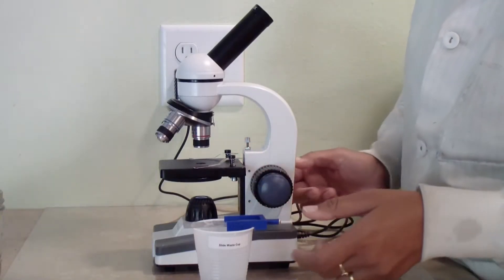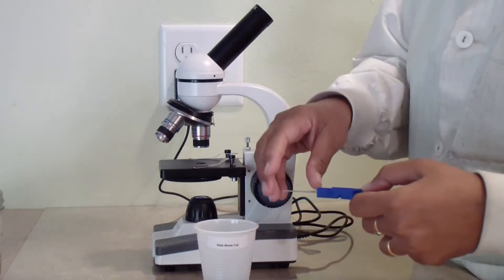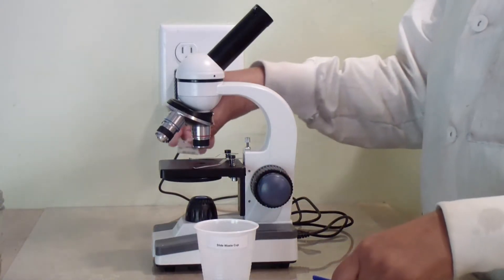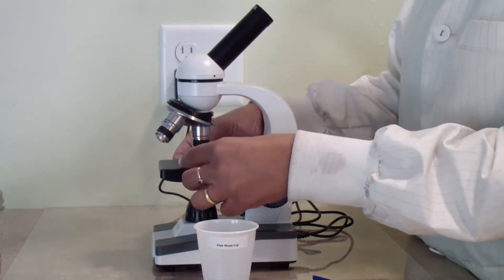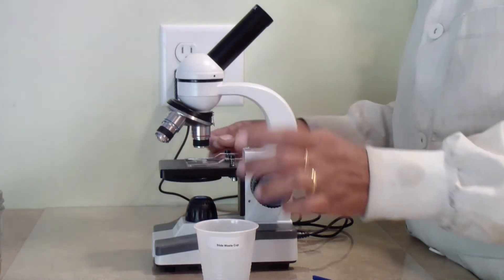Put the slide on the microscope stage. You will observe the sample at two magnifications: low magnification to scan the slide and medium magnification to see the microbes in more detail.